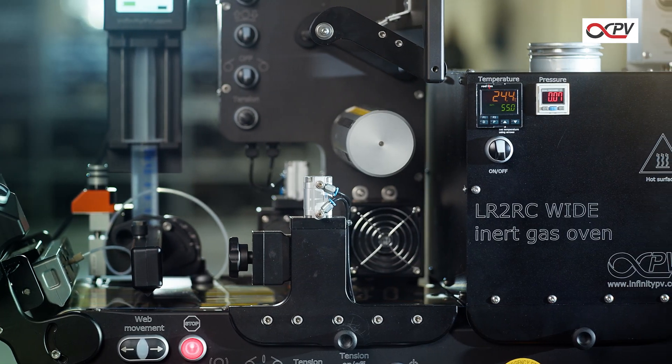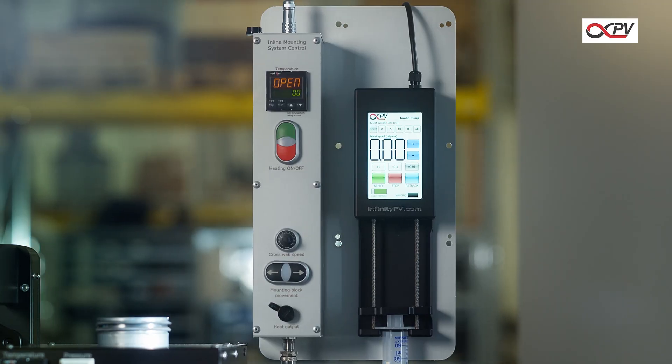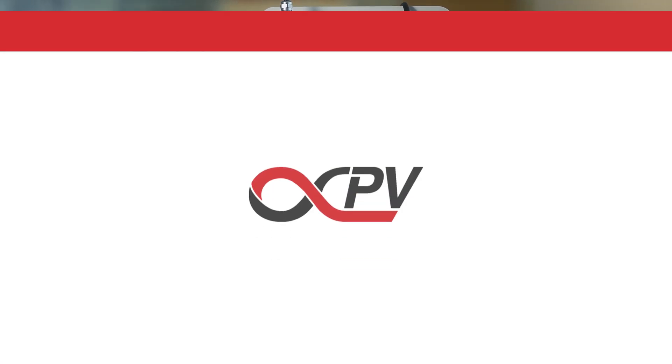All in one compact, lab-ready system. Learn more and configure your setup at infinitypv.com.